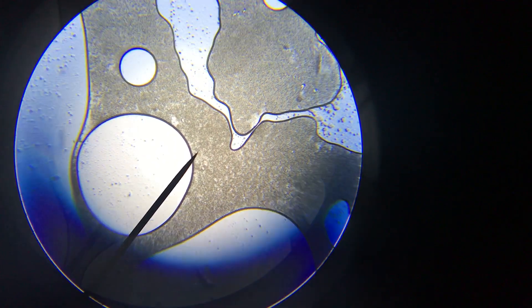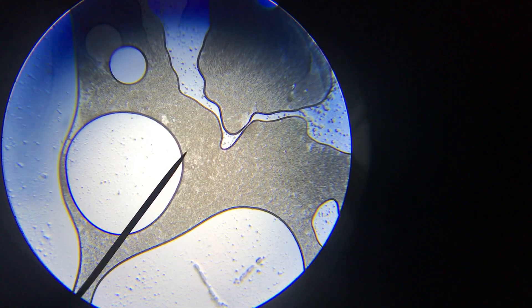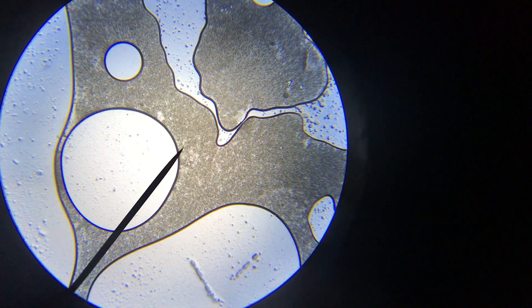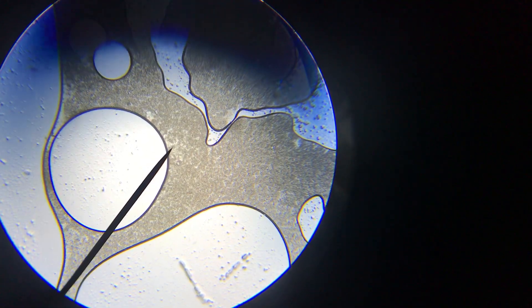I'm baking bread with it right now. Sorry, I'm trying not to move — it's just happening. But as the bubbles form, they're moving because there's not enough space. There's like a flow of yeast. I don't know if they're moving on purpose or if they're being pushed, but look at that. It's so cool.